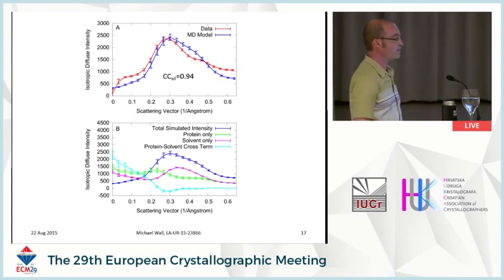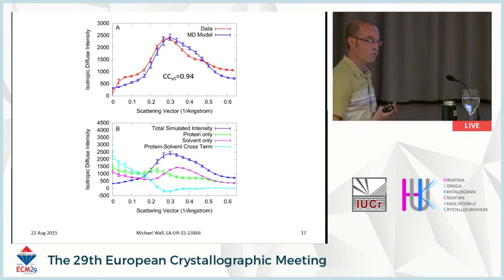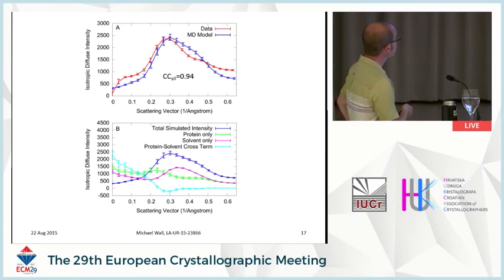When we compare the predicted diffuse intensity by this equation that I showed you previously to the data, what we've done is first compared the total intensity. So for the total intensity, if we calculate a Pearson correlation over 14,800 measurements that result from extracting the diffuse intensity and only counting data points that are not related by symmetry, we get a Pearson correlation of 0.94.